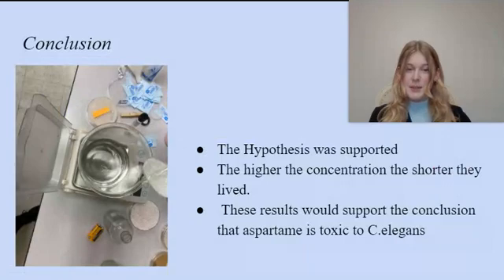In conclusion, my hypothesis was supported. The control plate containing worms grown on standard growth medium lived the longest, followed by the glucose plates grown with glucose added to the medium. The longevity of the worms was concentration dependent. The higher the concentration, the shorter the worms lived. The worms grown on plates with aspartame added were the shortest lived and also showed this pattern.